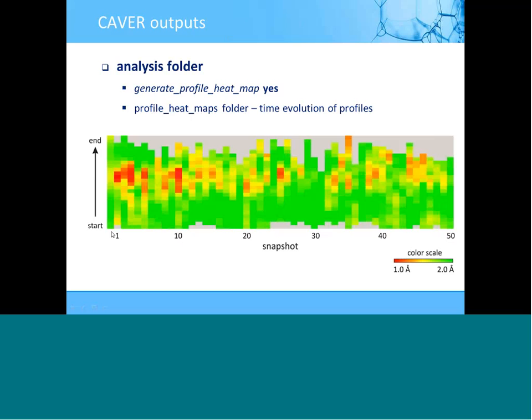of the tunnels changes. So you can see that the narrowest parts, the bottlenecks, are located sometimes in quite a different location, at the end or in the middle of the tunnels, and you can also notice the differences in overall width of some tunnels and also their length. Sometimes the tunnels are very short, sometimes very long, and it's all considering just a single representation of a single tunnel.